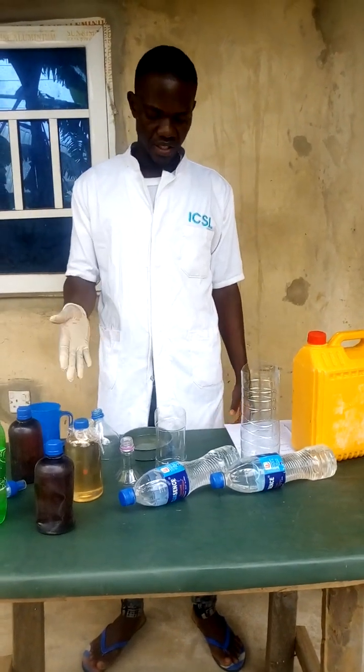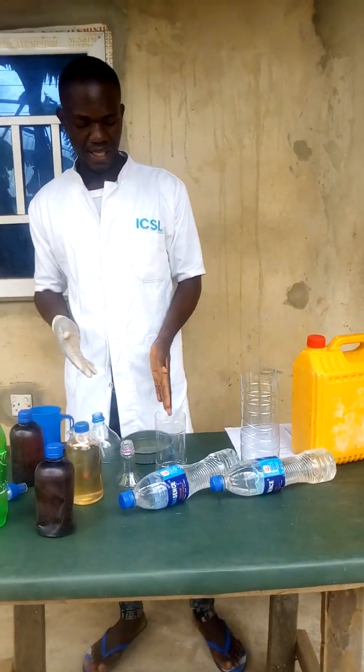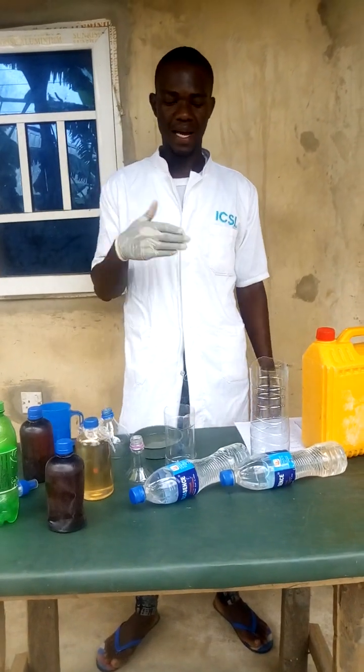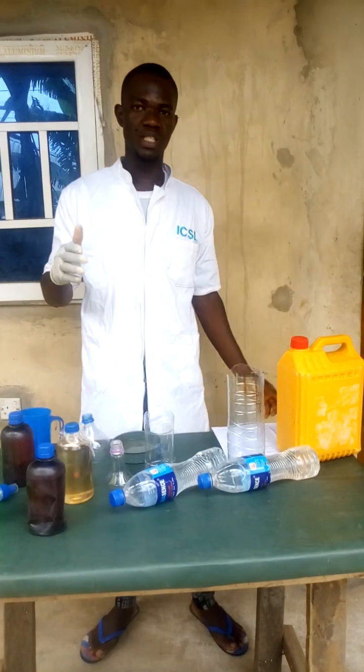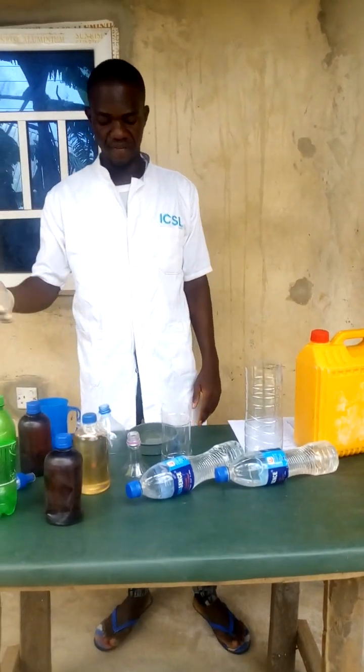So to increase the viscosity, you then use something like this. I'm using something like carbopol, but I'll be adding it in a very little quantity. But it's alright if the fluid is not completely very viscous.